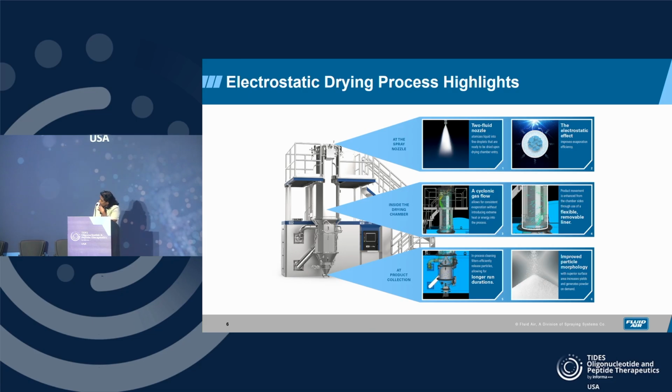So the drying gas for electrostatic drying is always nitrogen gas, because the electrostatics is a hazard. So all of the electrostatic drying units operate with nitrogen gas, and the operating temperatures are between 40 to 140 C always. They do not go higher than that.